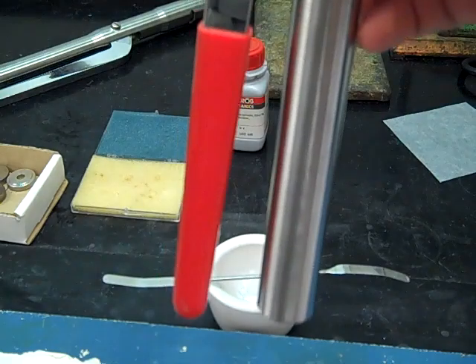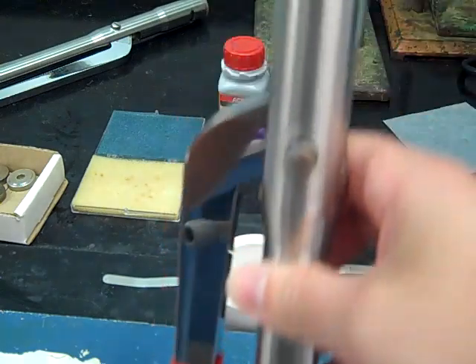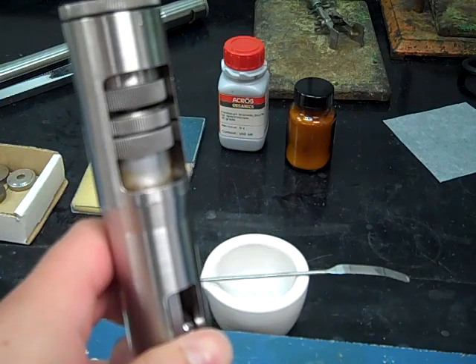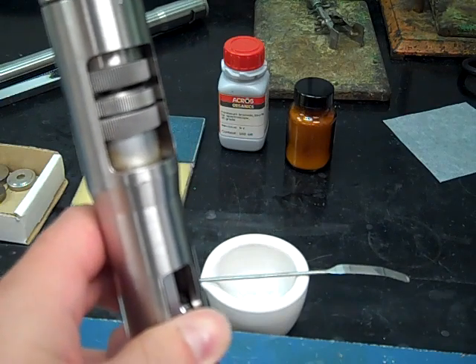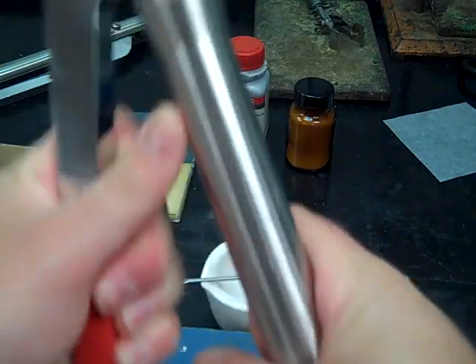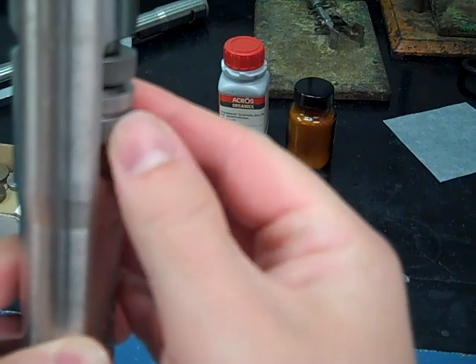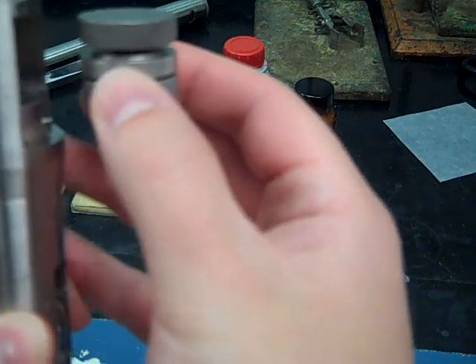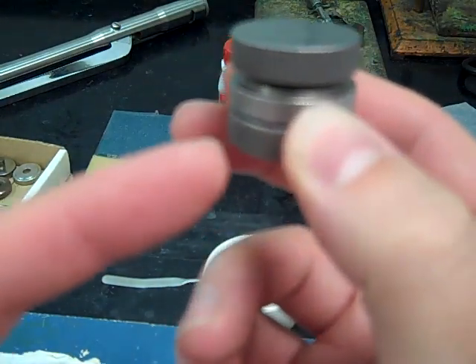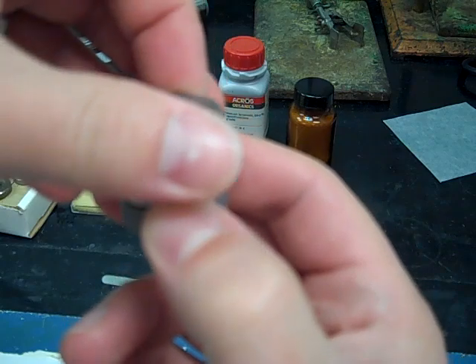So now I've got it squeezed together. I'm not putting brute force strength on it. It kind of locks in place, and at this point it's actually pressing that solid in between the two bolts. So I would leave it there for 5-10 seconds, and then be very careful to gingerly open this up so that you don't jar that pellet. Once it's open, again, you want to support it by the bottom. To remove the actual pellet, you want to support by the bottom and middle, and then very carefully take that top off.